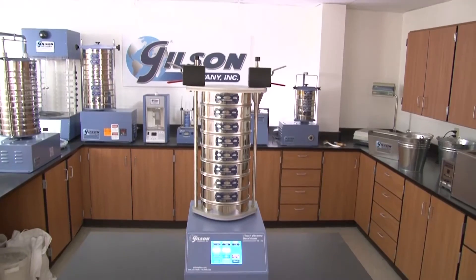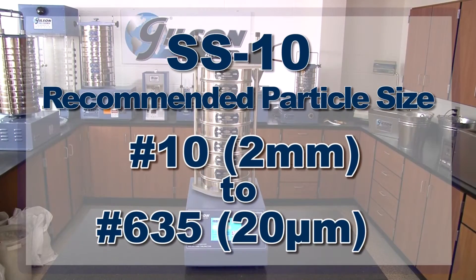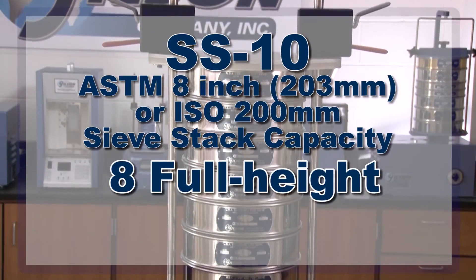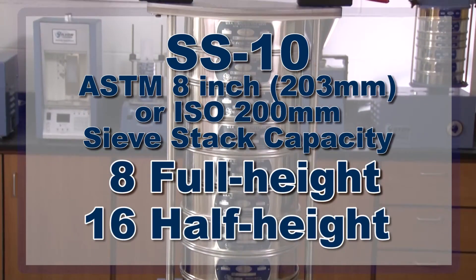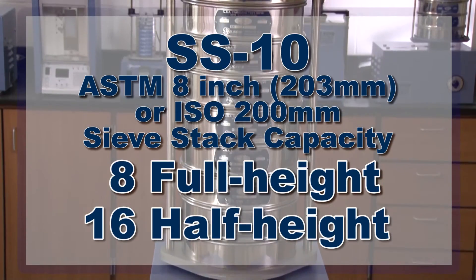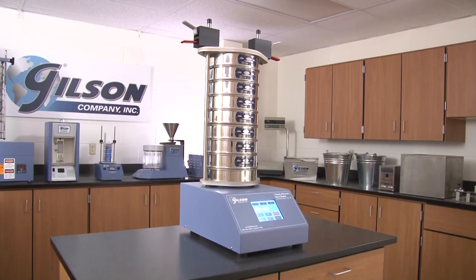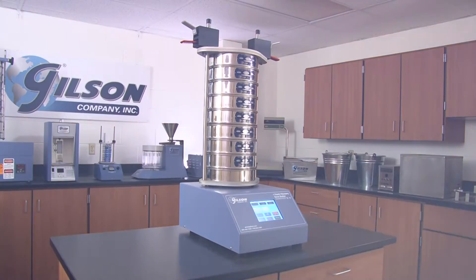With a recommended particle size range from number 10 to number 635, the SS10 accepts up to eight full height or 16 half height ASTM 8-inch sieves or ISO 200 millimeter sieves plus a pan, and is the perfect choice for any material testing lab.